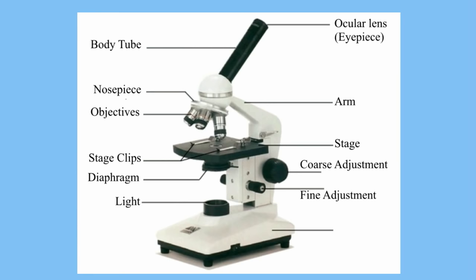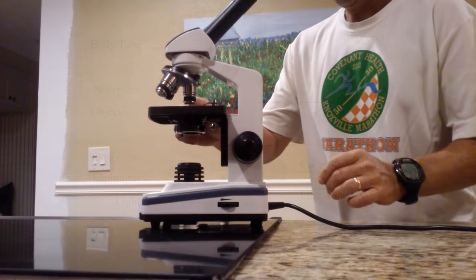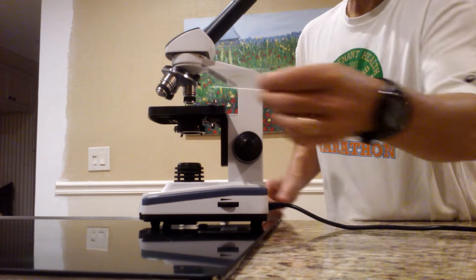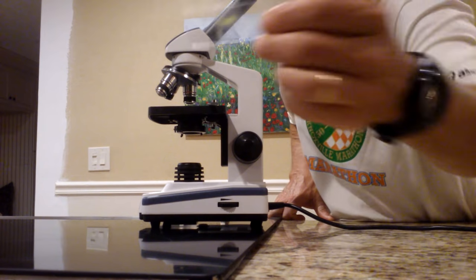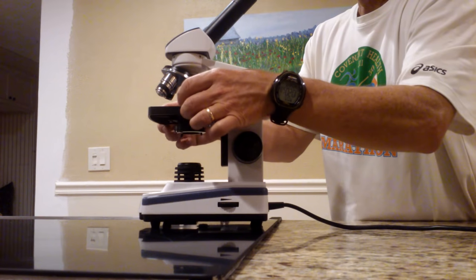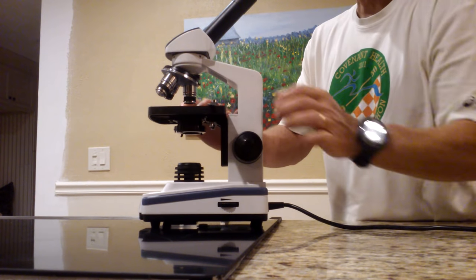Those are your basics. Next, let's talk about how we focus and use the microscope. Now that we have talked about the parts, let's talk about focusing. I have a slide here with a leaf on it — we are looking at plant and animal cells this week. The first thing you need to do is go ahead and place the slide on the stage.